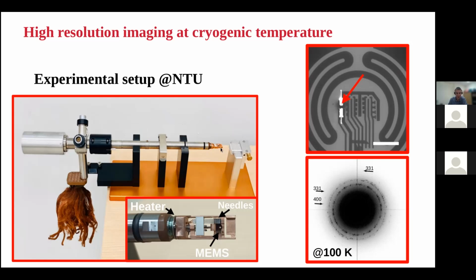At the tip of the holder, which is shown on the right-hand side, is where you put your specimen and where the electron beam goes through the specimen and interacts with your material. And then the rod is about 25 centimeters long. From the black part onward, it's all outside of the microscope, where you can apply the electrical connections, or you can put a nitrogen dewar below the holder to cool it down.